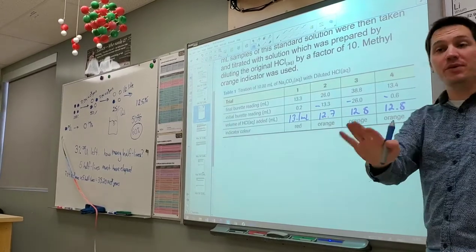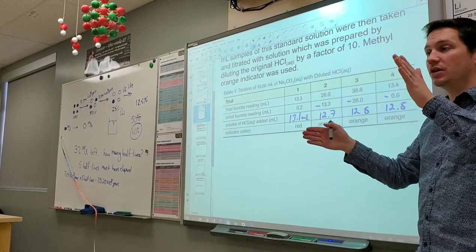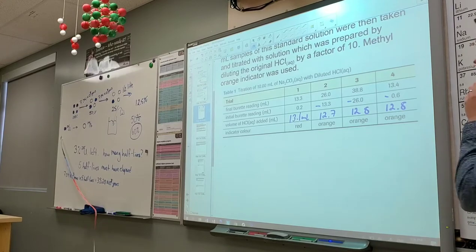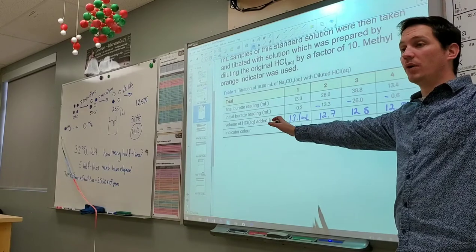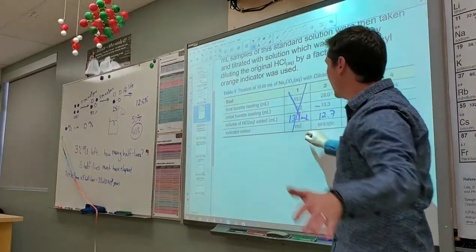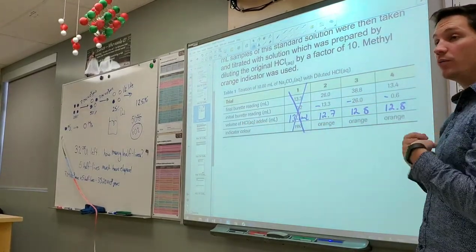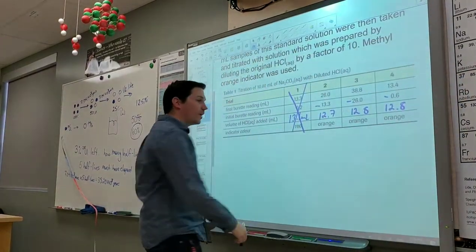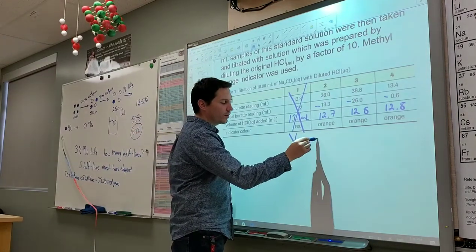So, do you have 3 values that are within that 0.2 milliliter range? The highest and the lowest agree within 0.2 of each other? Yeah. Okay, perfect. One of these trials we need to totally ignore when we're doing our analysis. Which one? The first one, totally ignore it. We still wrote it down, we still observed it, but now that we're doing our analysis, we're ignoring it.